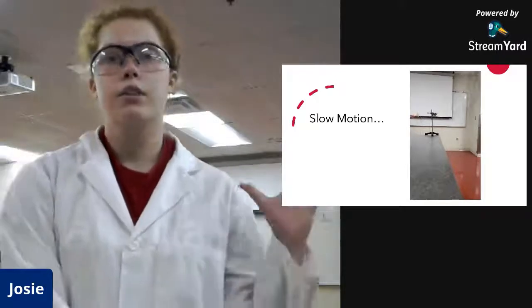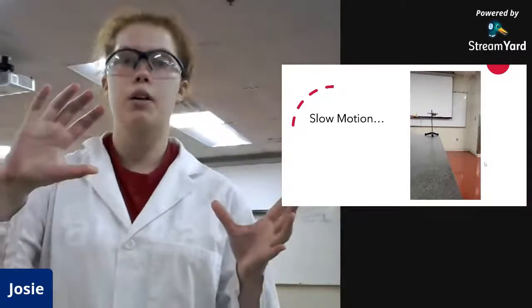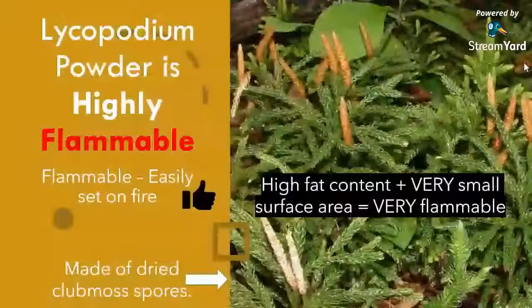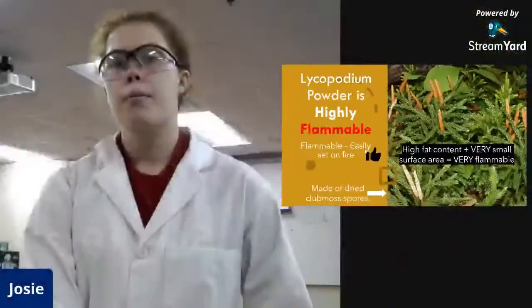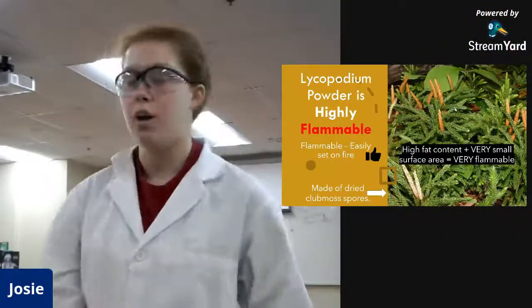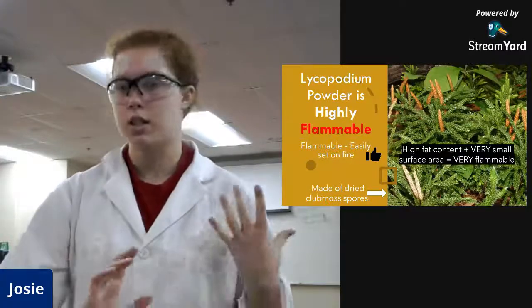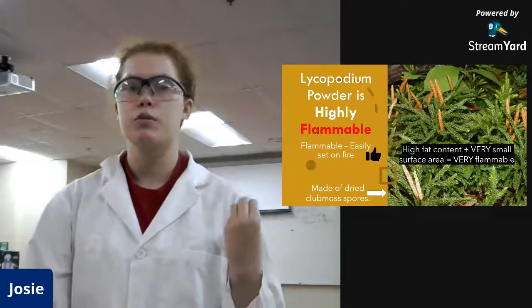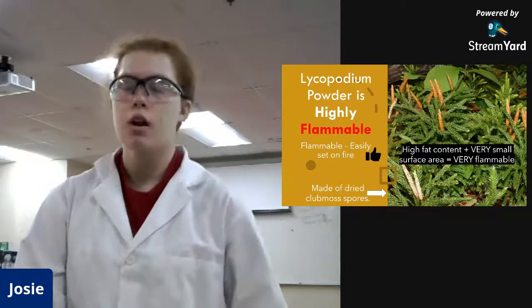So it's just a neat way to show how the fire kind of works its way through the powder that's in the air. So it's really important that you launch the powder into the air. So lycopodium powder, as you could see, was highly flammable, which just means it's easily set on fire. So it's made from the spores of something called club moss.